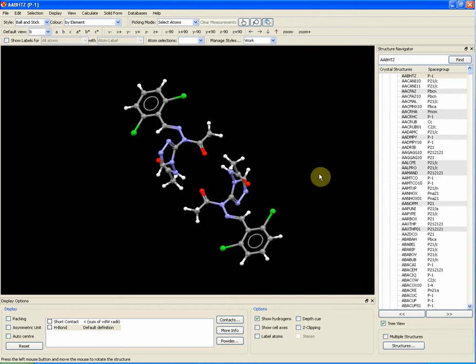When we have used the tool to show what is next to a molecule, we can then use the contact options to show how the two molecules contact each other.